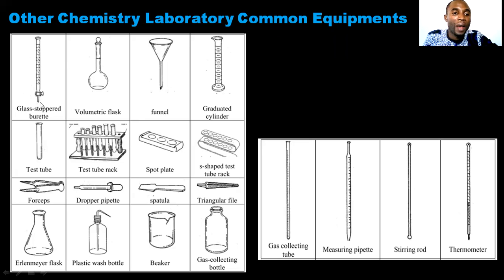This is a glass stopper burette. This is a burette. We have this glass stopper. This one is what we don't use. We don't use a clip on this one. We use this one, the glass stopper burette.